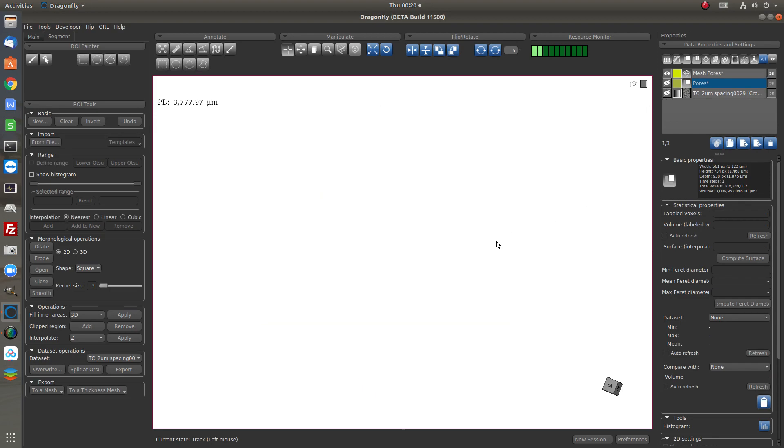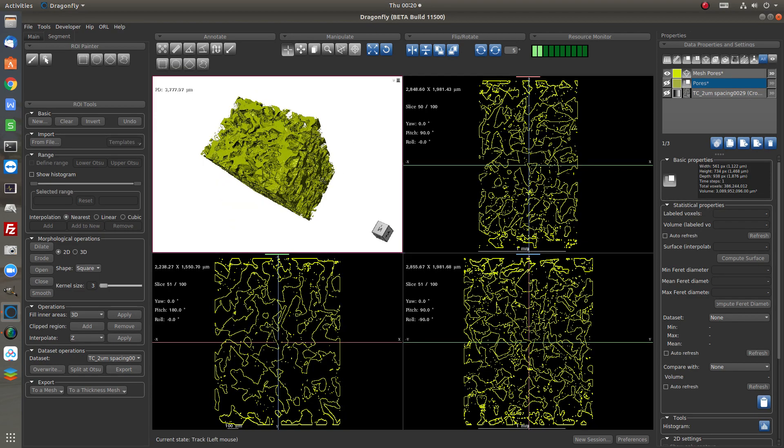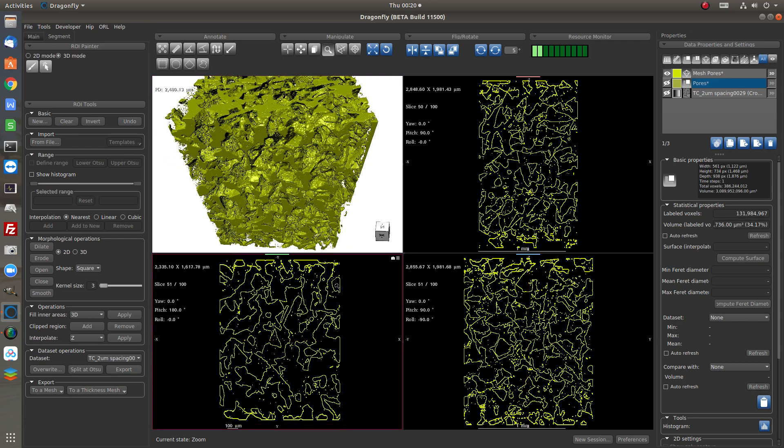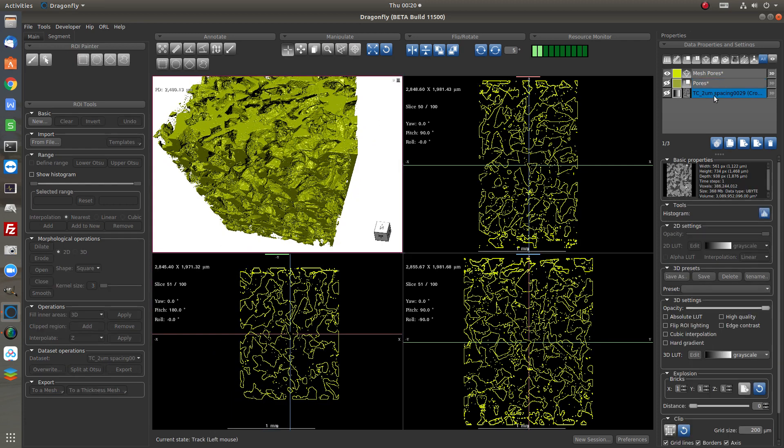So this is the basic workflow for pore modeling and from the volume data to the mesh model.